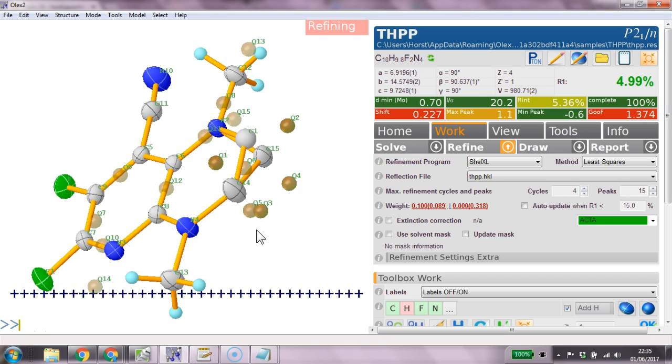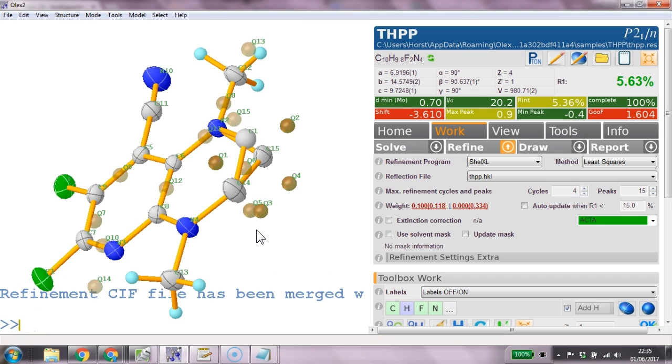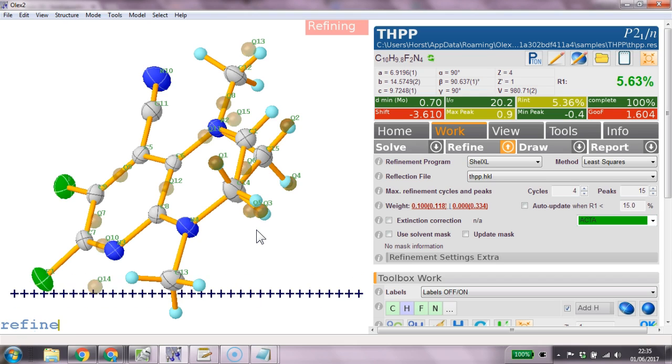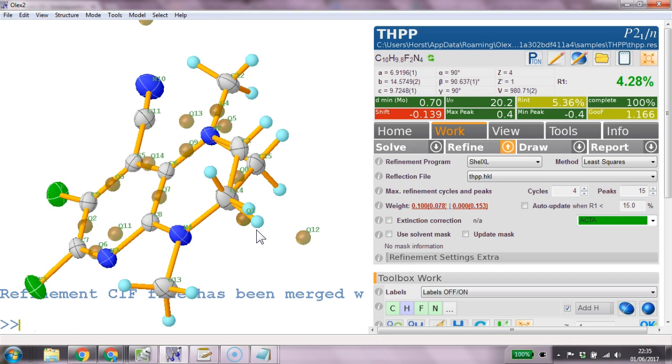The occupancies are linked and refined like this. We go harness. We go h add. We go refine. And we are basically exactly where we were before.